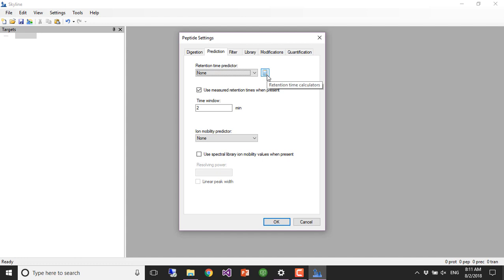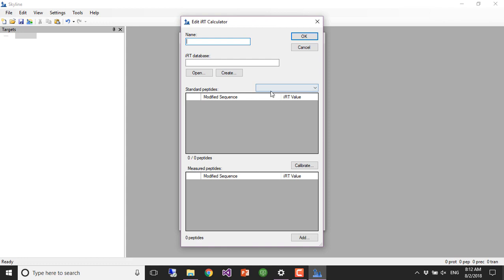we're going to add a new retention time calculator. Should we do that? Sure. Add a new retention time calculator, and we'll just call this Biognosis human.